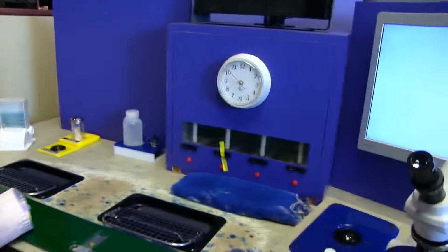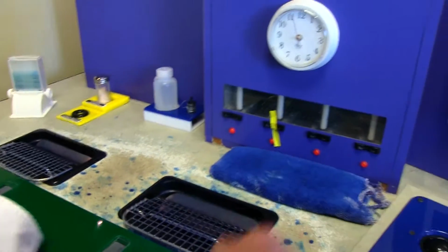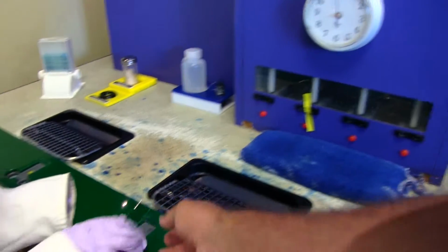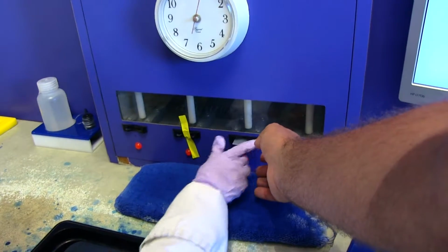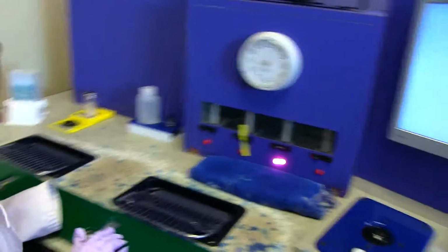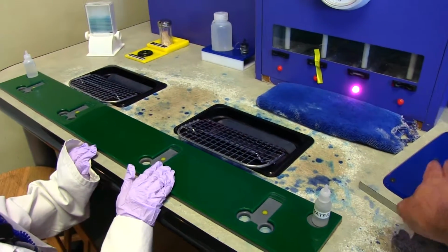Put your slide into the slide dryer until the light goes out. When the light goes out, remove your slide. The slide dryer fixes or dries the cells onto the glass slide. If the cells were not fixed onto the slide, they would wash off during the subsequent staining and washing procedure.